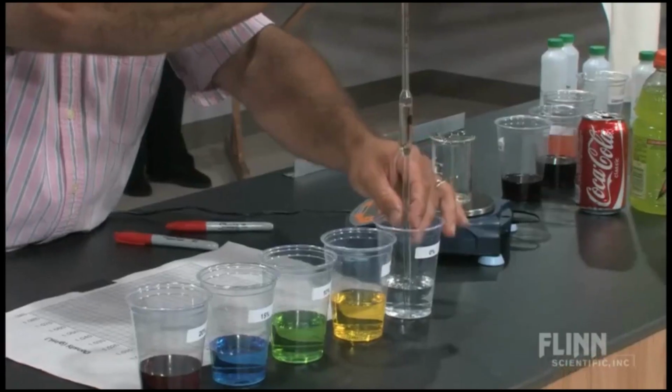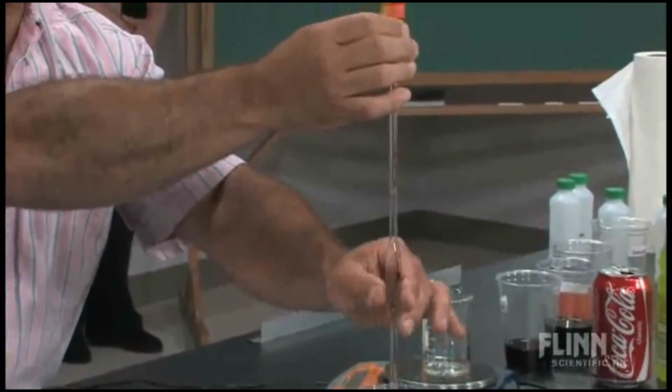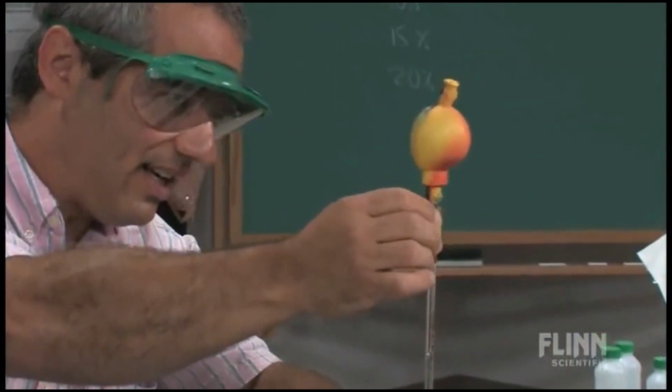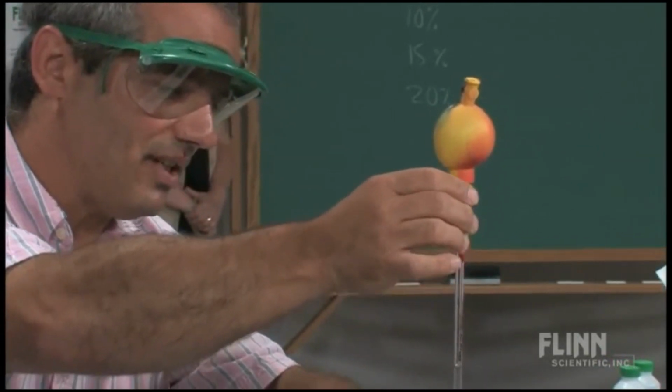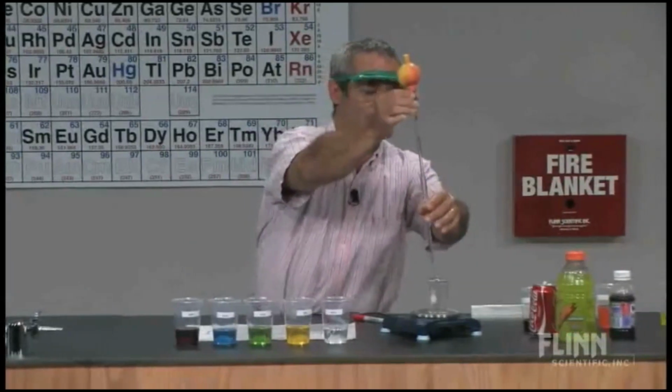It sits on the bottom, by the way. That's what blocks. You have to lift a little bit off the bottom. And well, I'm just about there. I got a little bubble there. And now I'm going to use this to bring it down. Oh, perfect. Okay. And the technique involves then coming over here.